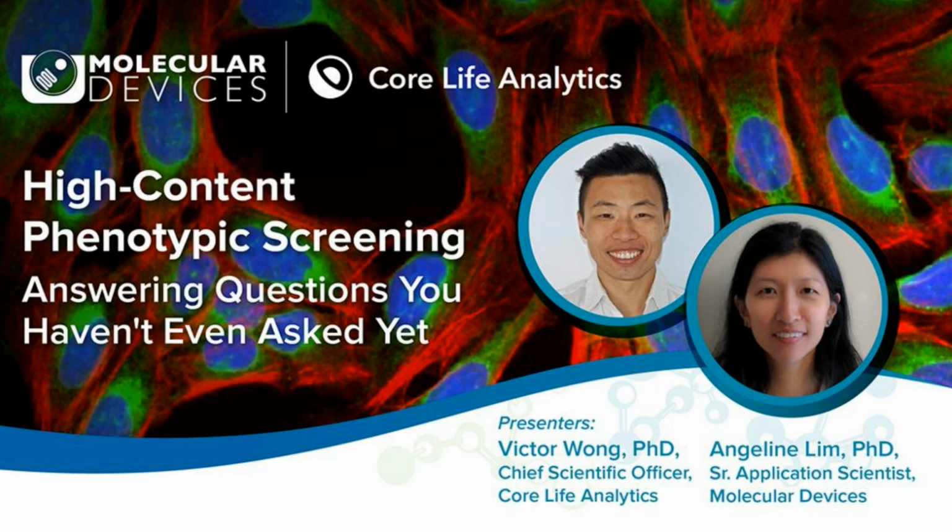But if you want to inspect all kinds of different quality metrics, try out different normalization methods, and act in a very explorative manner, which some of you might do, then it of course can keep you busy for weeks if you're not sure what you'd like to find. So that really depends on the way you're doing your analysis. I hope that helps. All right, thank you.